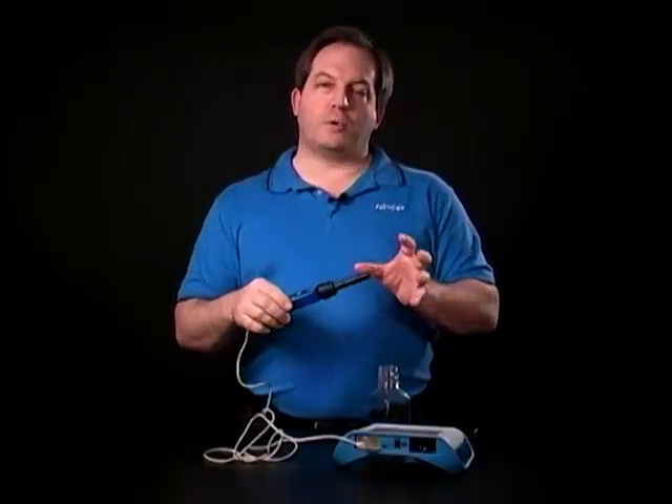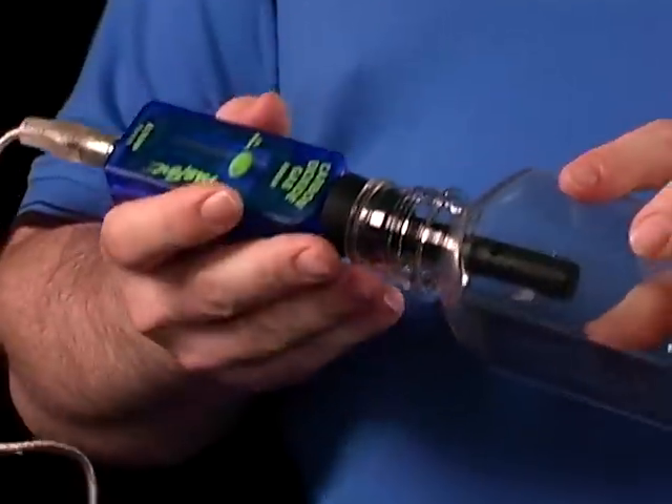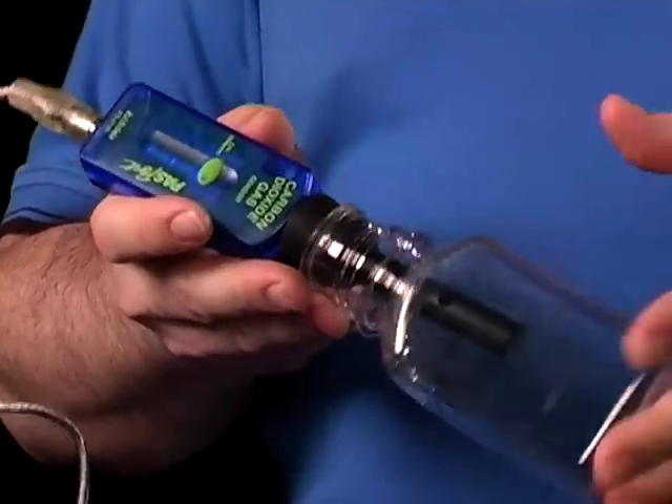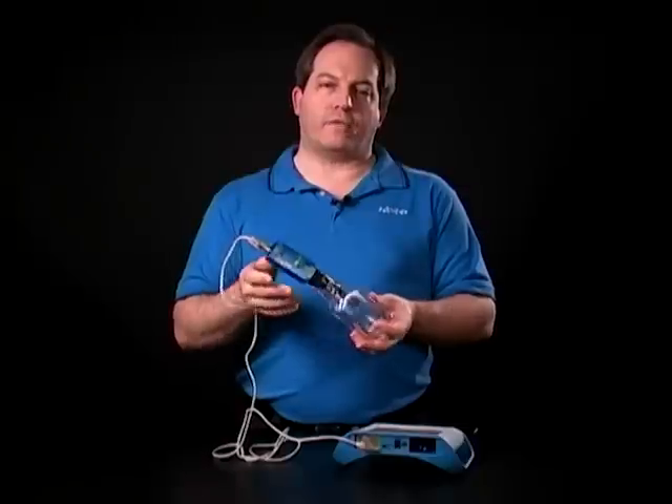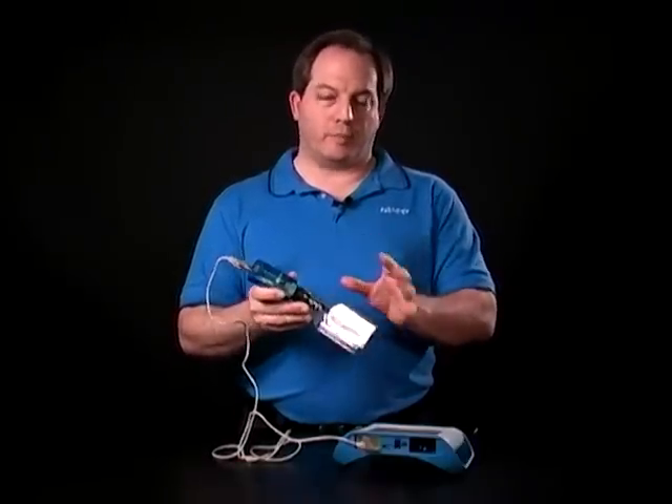When you're using it, you want to make sure that when you're connected into a sample bottle, this is not a tight seal. There is a little bit of room for air to move back and forth through there, so if you're evolving a gas or something like that, it is going to seep out slightly, so just be aware of that.